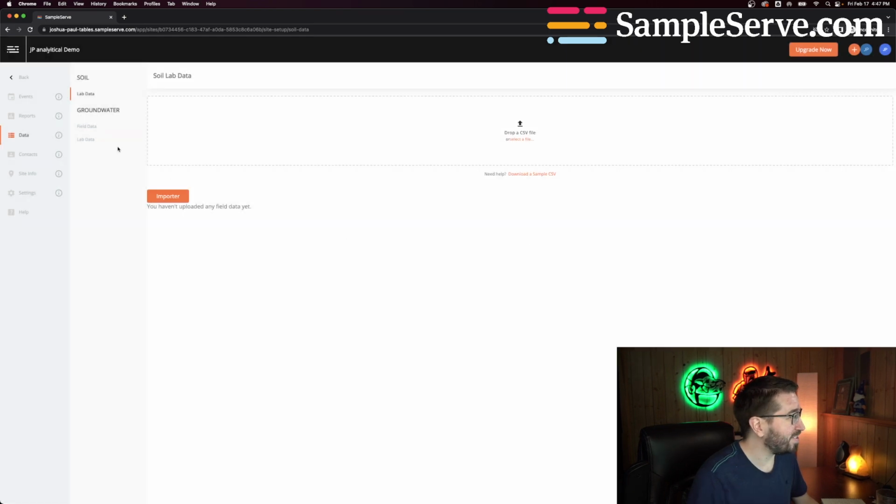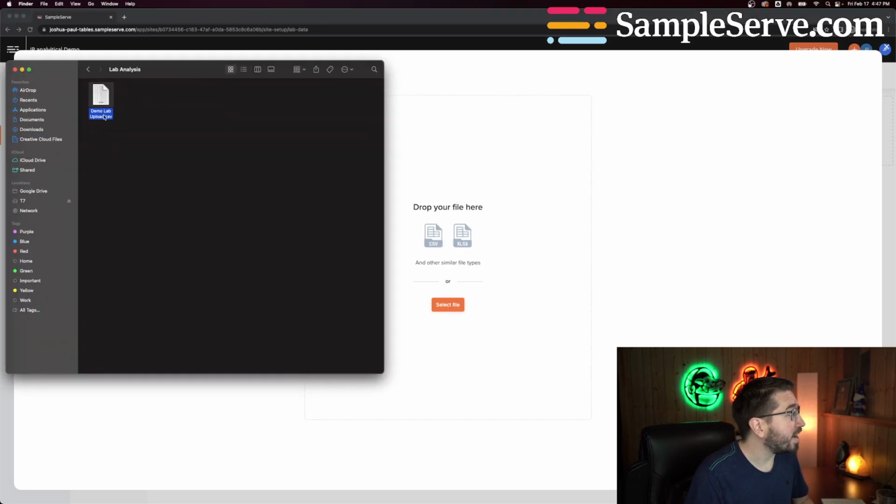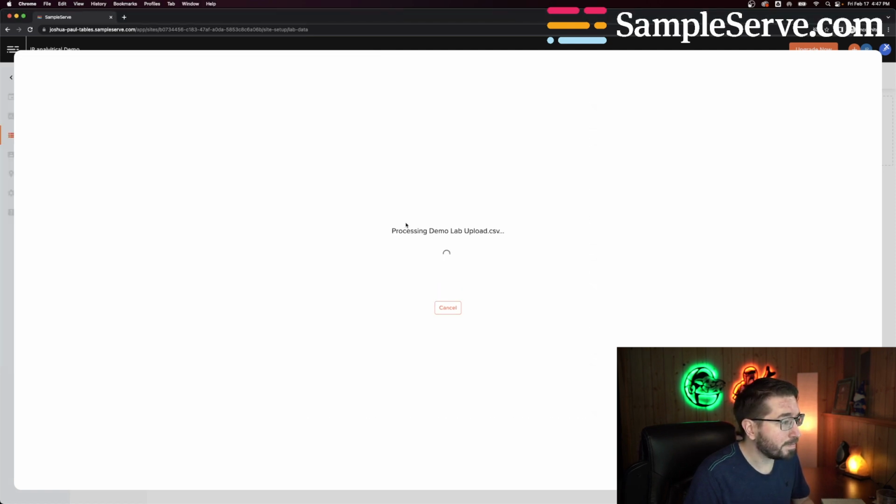Let me skip through these tutorials. They're everywhere. Lab Data Easy Importer. So you can either download a sample CSV and manipulate your own files and drag and drop them. But because our file is not formatted the way it should be, we're going to click Easy Importer here. We have an analysis file that we're going to drag and drop here from a laboratory.